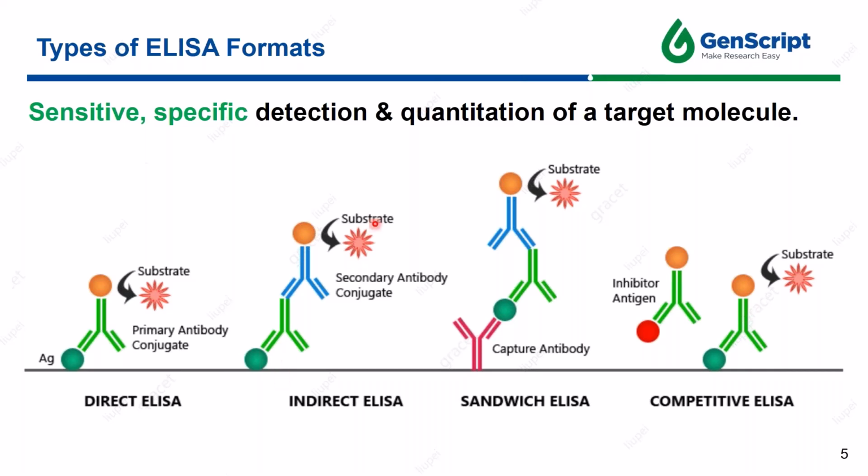It's very widely used in our ELISA kit development. The procedure for sandwich ELISA firstly requires a well of an ELISA plate to be coated with the capture antibody. Then the antigen in the sample will be added in the well. Then during the stage 3 step, the paired primary antibody will be added in the well, and finally the secondary antibody conjugated with HRP will be added.